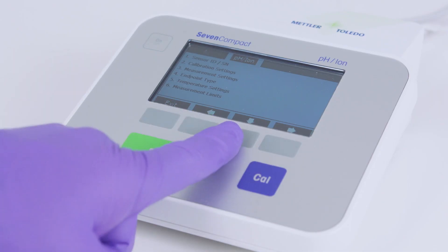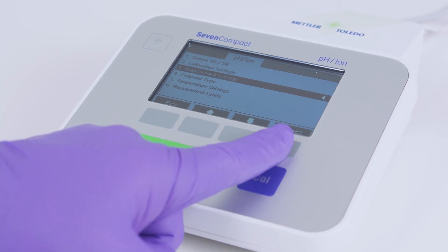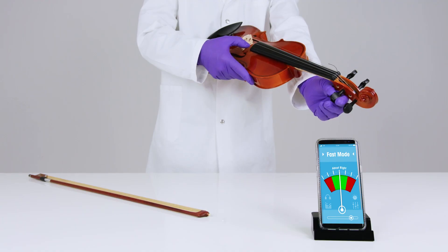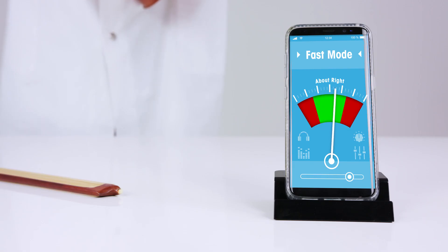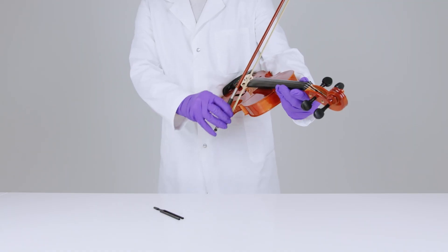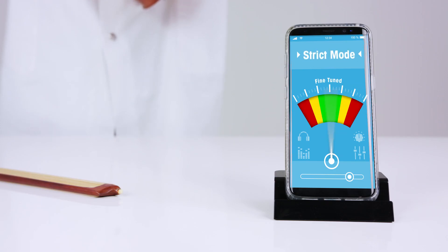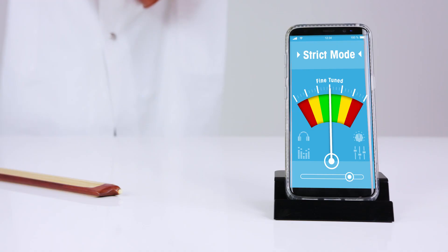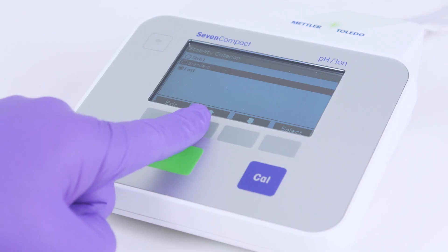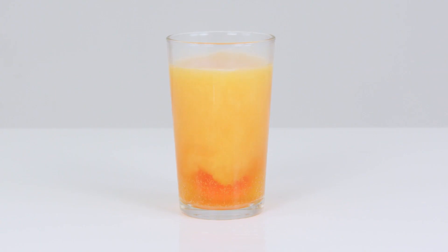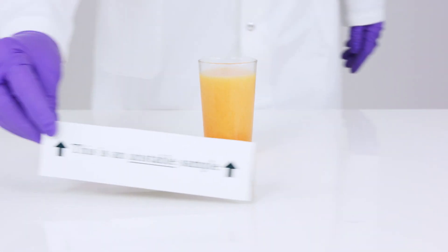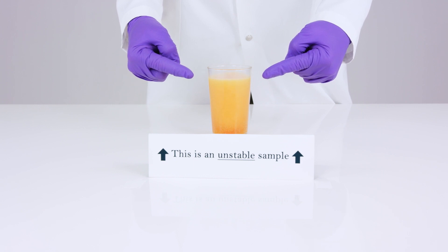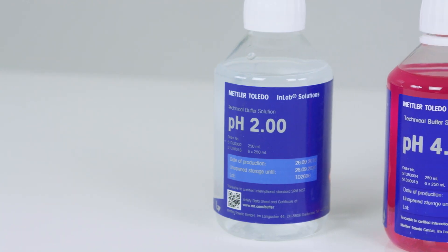The next step is to set the stability criterion. This controls how accurate the sensor will be. It's all about speed versus accuracy. Imagine this time we're using an automatic tuner for the violin. The fast setting offers a quick result which isn't that accurate, so the music sounds okay, whereas the strict setting gives a highly accurate result, but it takes longer to make the measurement. Standard is a good choice for normal measurement and calibration. It's important to bear in mind that if you have an unstable sample, using the strict setting may result in never obtaining a reading at all, in which case it's best to use the standard setting or fast for very unstable samples.